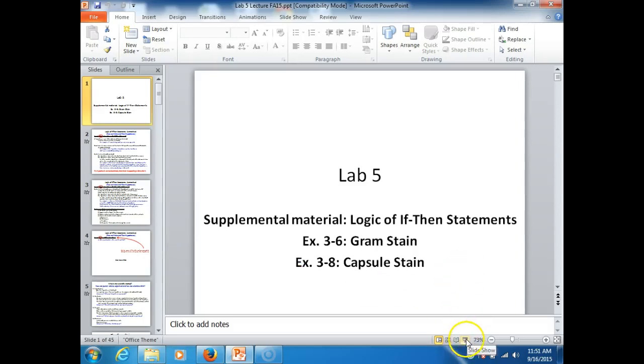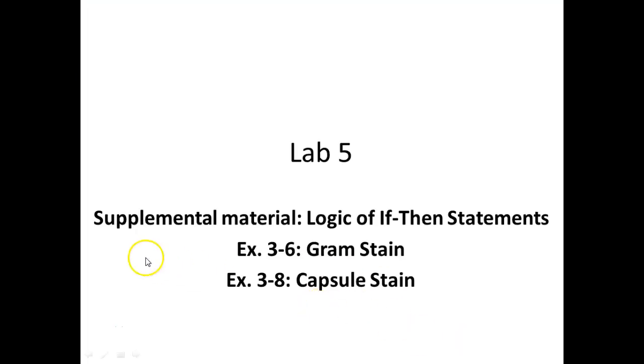So today is Lab 5. A little bit about logic, if-then statements, basically hypotheses. And then we'll go into the two stains that you're going to do today, gram stain and capsule stain.